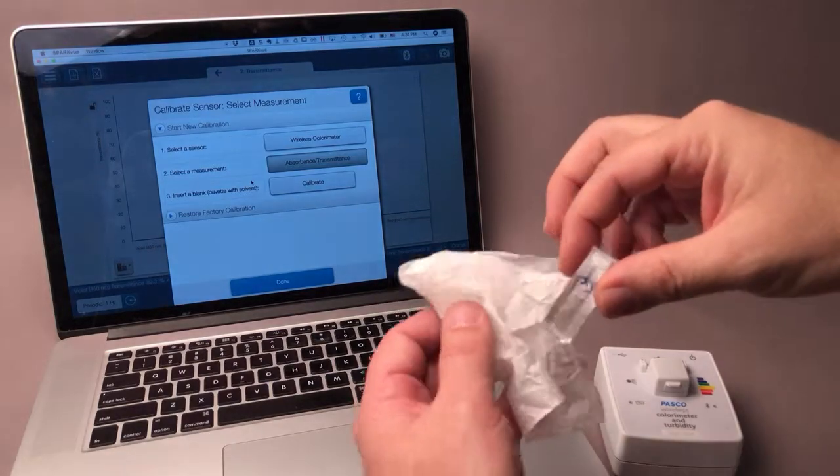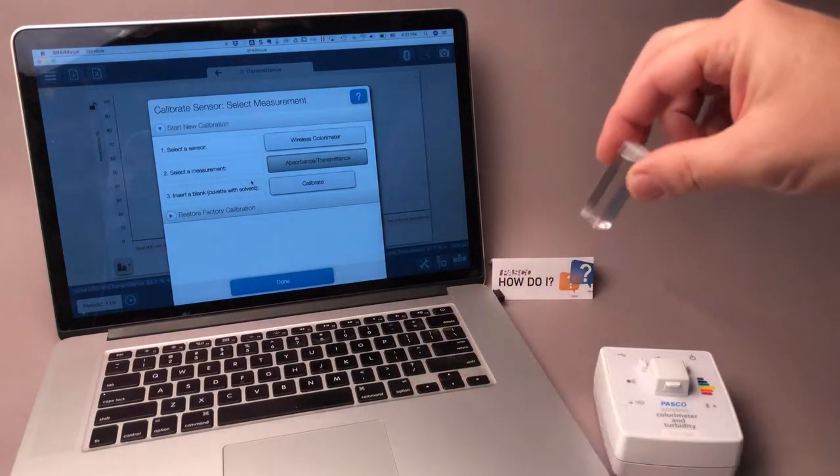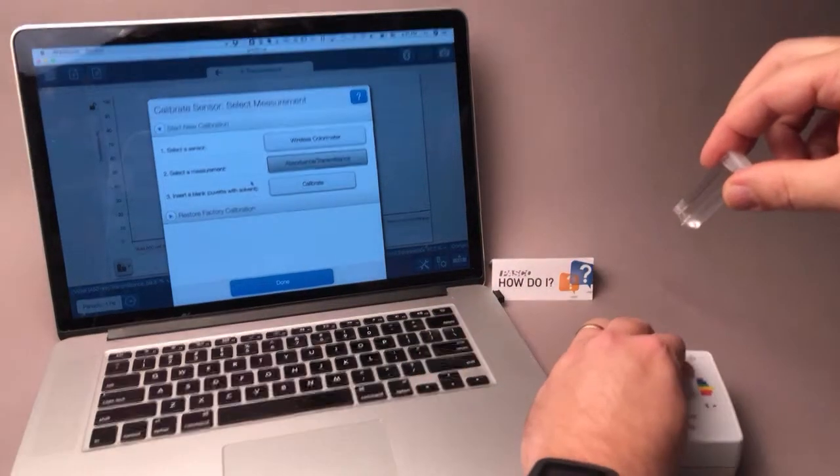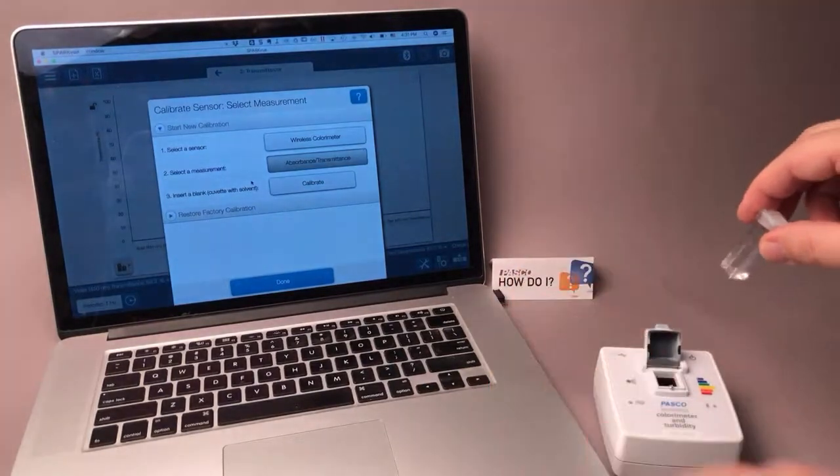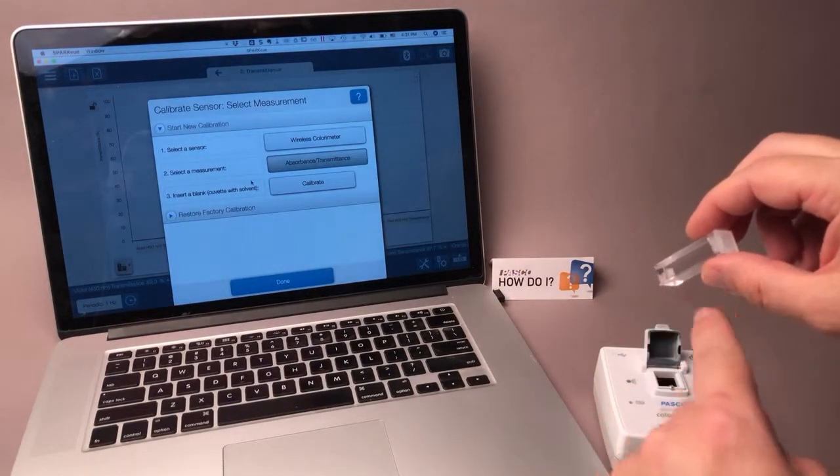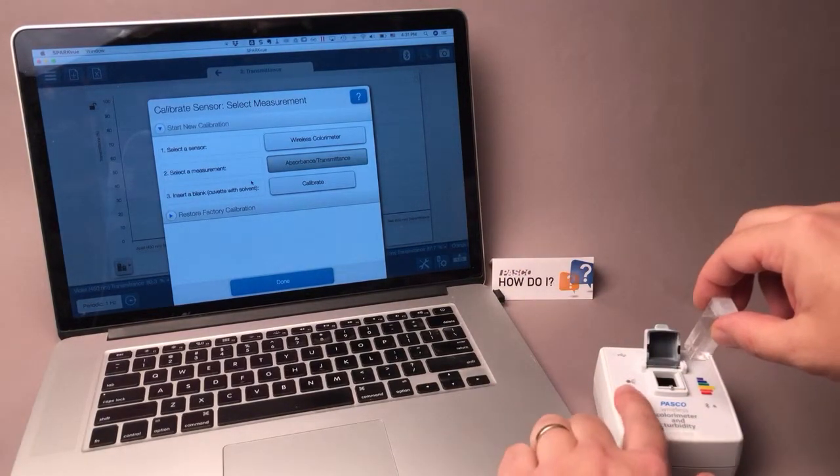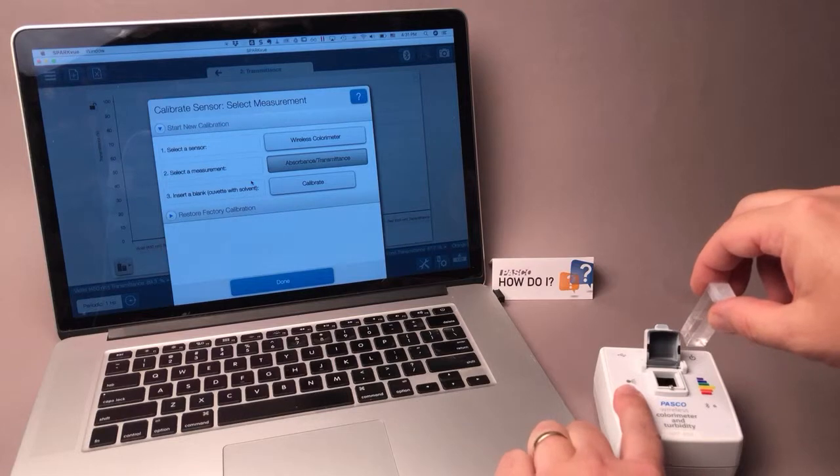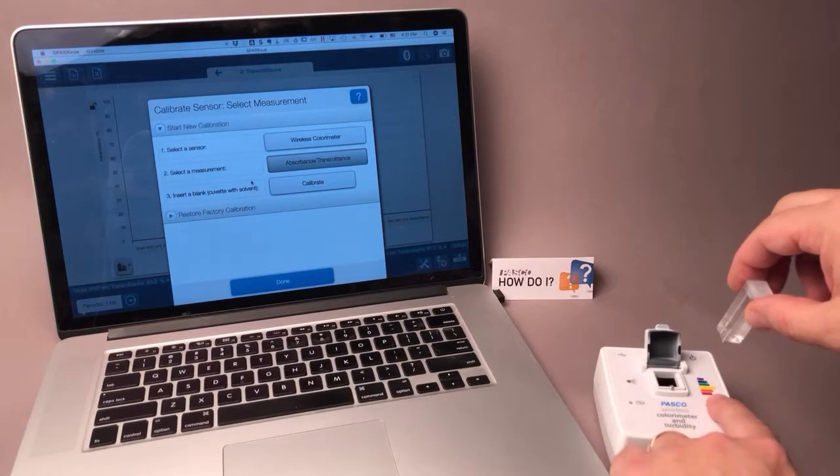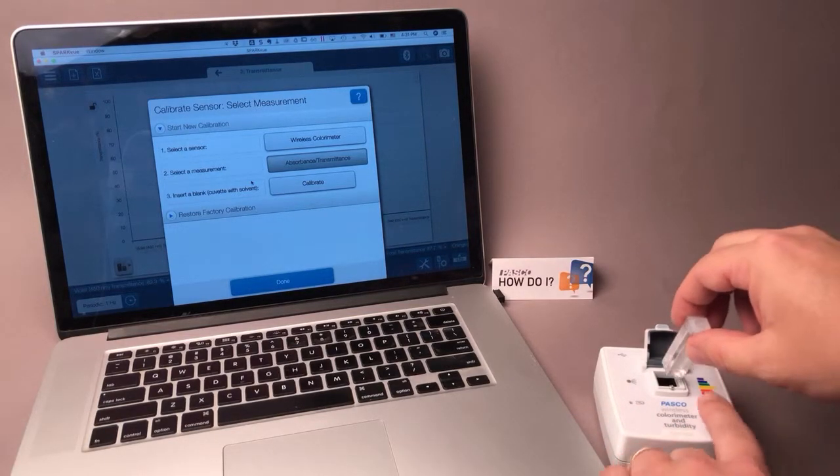I'm going to clean the two clear sides of the cuvette with the tissue, open the lid of the sensor, and I'm going to make sure that the clear sides of the cuvette are facing the light source and the colorimeter sensor as indicated by the colored bars.